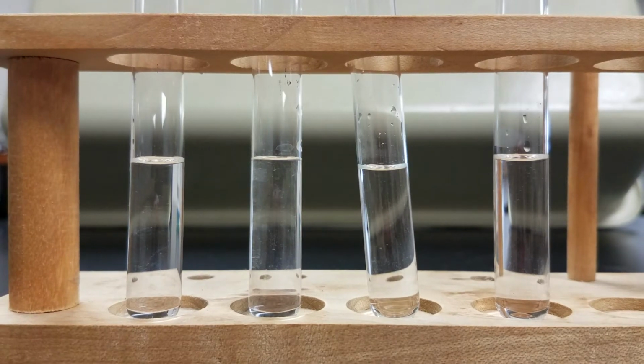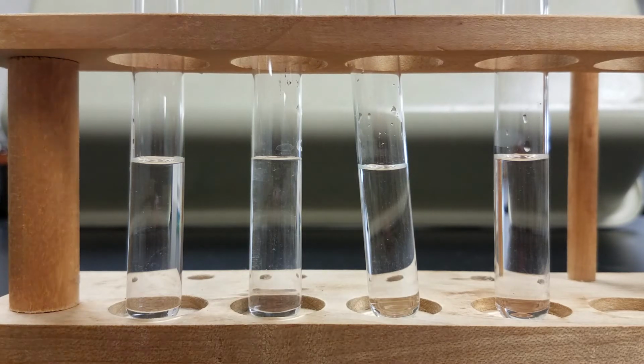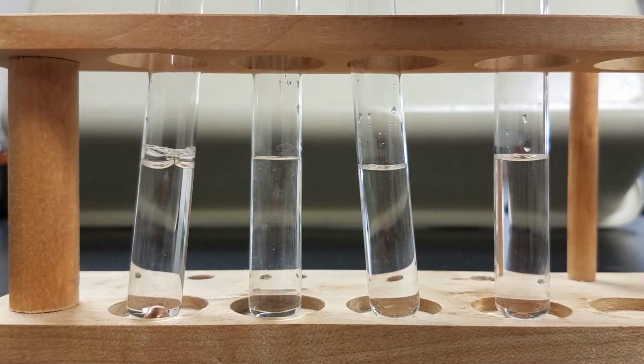Once again, I have the same setup, except this time in my test tubes I have a solution of zinc sulfate, but I'm going to add the same 4 metals that I did before. So let's see what happens when I put the copper in the zinc sulfate.